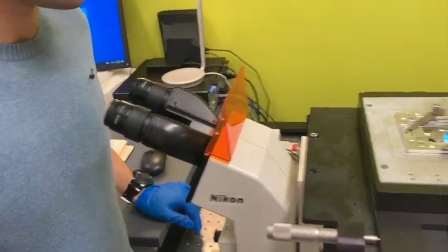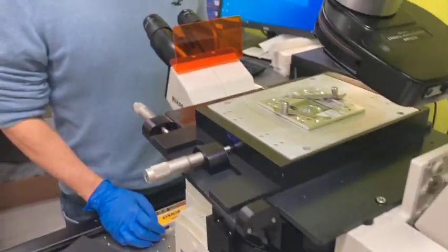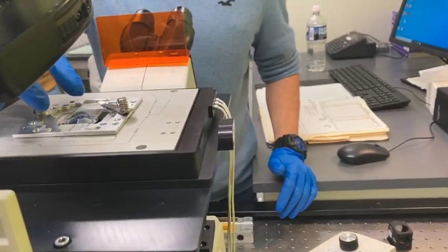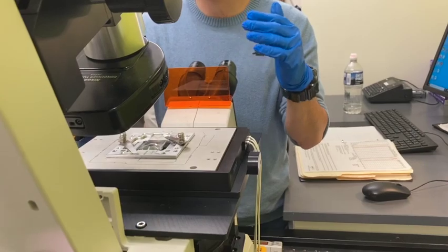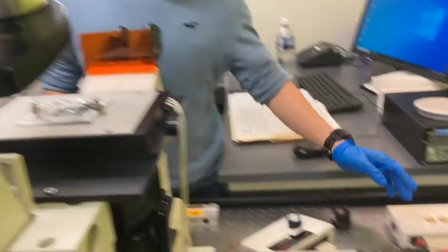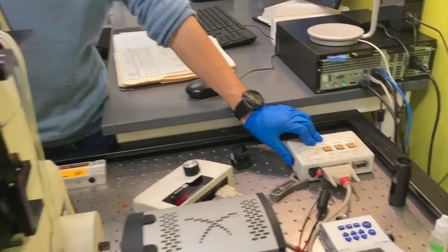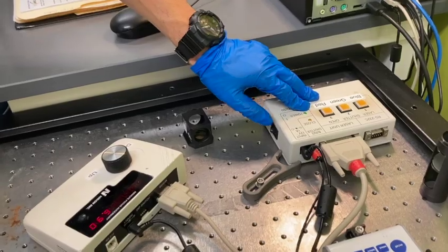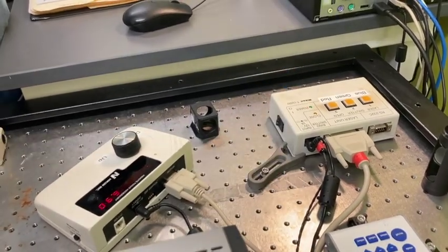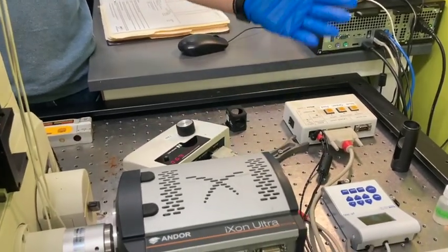Basically the power off is the inverse of the power on. We don't want to take your sample off when the laser is still on, because there might be a reflection that will go to your eyes. So laser off, and you can turn this switch off, or sometimes I will just leave it on. If you leave it on, when you turn the main power on, it will automatically turn on, so you don't need to turn the second switch.